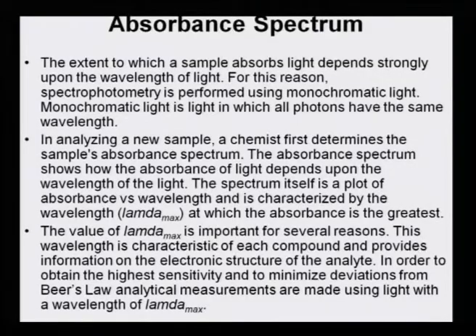In analyzing a new sample, a chemist first determines the sample's absorbance spectrum. The absorbance spectrum shows how the absorbance of light depends upon the wavelength of light.